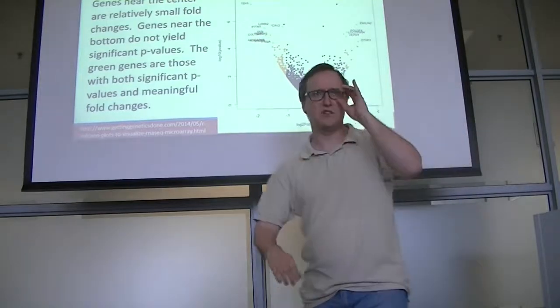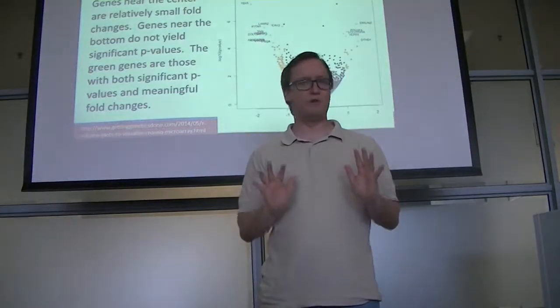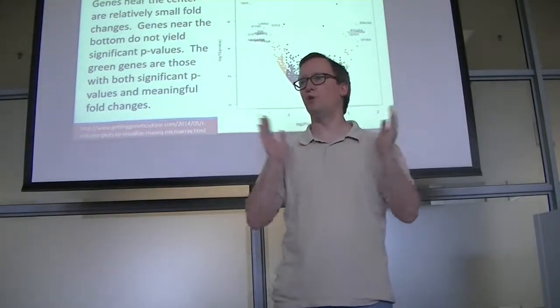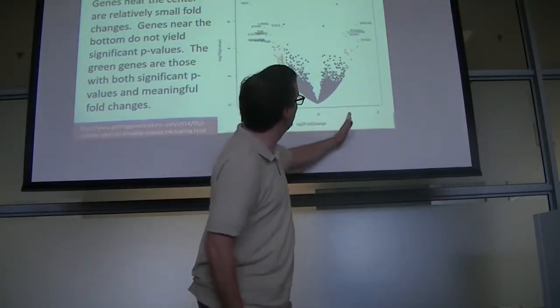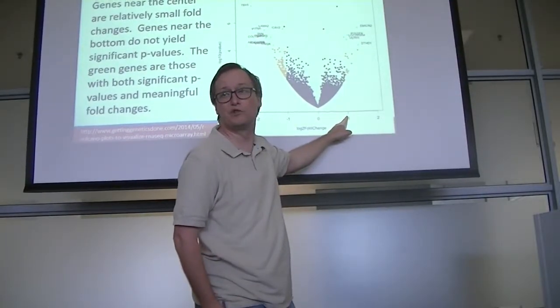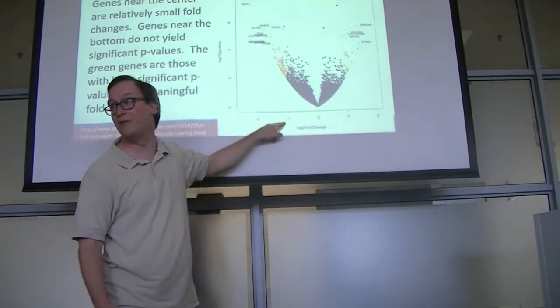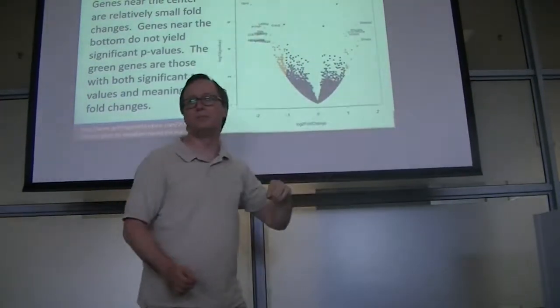Okay, so I'm going to just give you a bit of biological lore here. In general, when people interpret these, they say, I'm not interested in any fold change less than 2-fold. Okay? So on a log base 2 fold change map, that means we're going to draw a line right here at 1, because that means twofold change up. And we're going to draw in another vertical line at -1, meaning twofold change down. All right, so just imagine, whack, we've thrown these barriers in here.